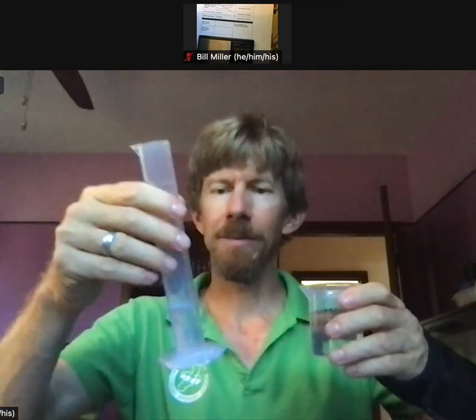It says record the mass of a 100 milliliter graduated cylinder. And I'm going to do something a little different this time. I'm actually going to put some of my reverse osmosis tap water here, and I'm going to put it in first. It's clean and not necessarily dry. It's got some water in it. And I'm going to put in about 20 milliliters. And then I'm going to weigh it.